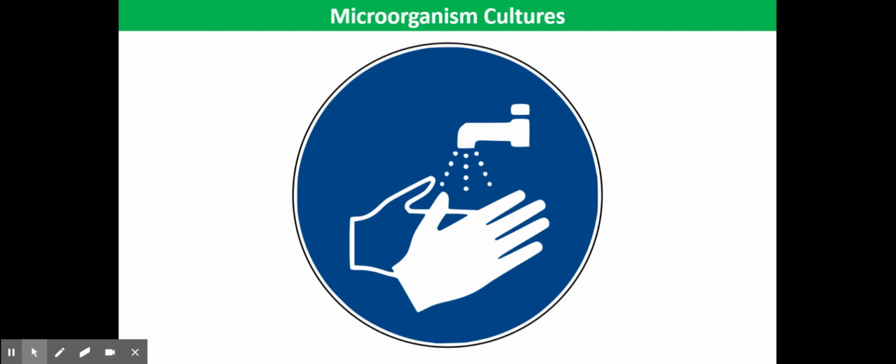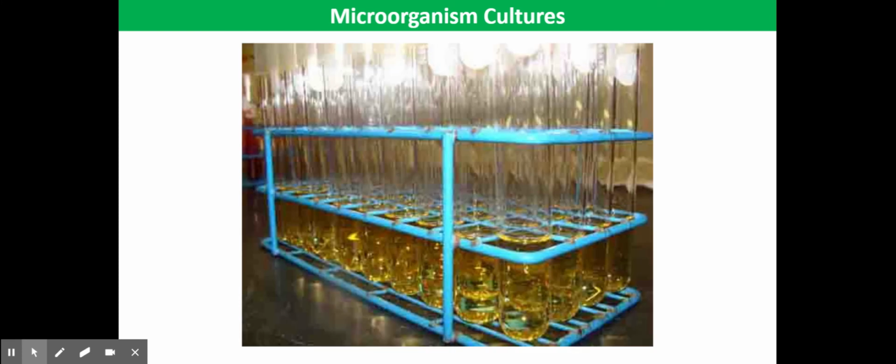And finally, just think about using liquid medium instead. A liquid broth is initially clear but will turn cloudy when bacteria have grown. A liquid broth can be useful to increase the numbers of microorganisms before transferring to agar plates for counting or for identification. Similar aseptic techniques will be used as already described in this tutorial. Liquid broth can be used to investigate population growth.